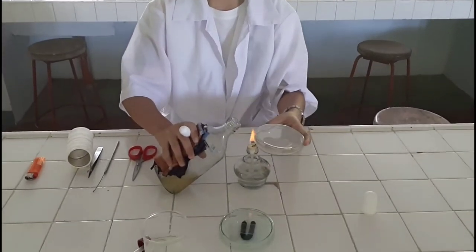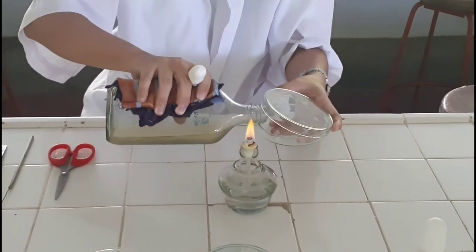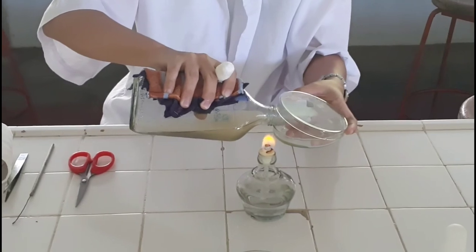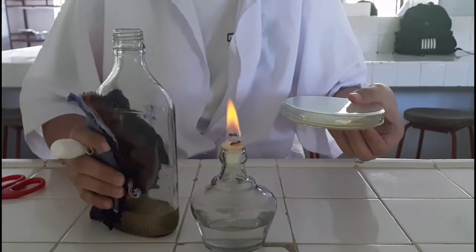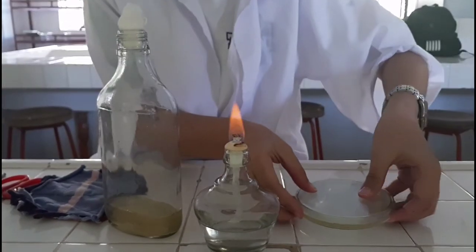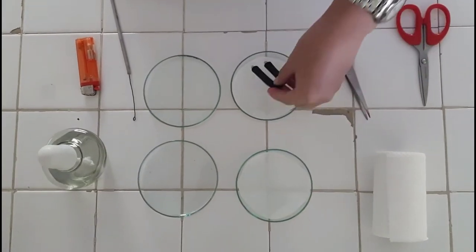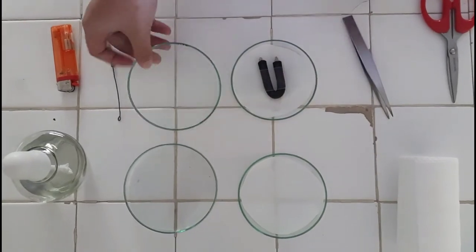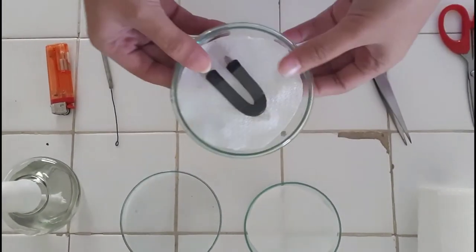Aseptically pour the 10 ml PDA into a sterilized petri dish and allow it to solidify. Reflame and put back the cotton plug. Prepare the petri dish containing tissue paper on the base on which U-shaped rod carrying a glass slide and a cover slip, and it's ready for sterilization.